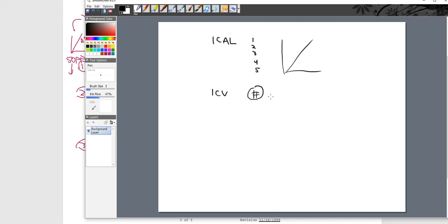That value better match. Cha-ching! Works out great. We're within the threshold of 10%. Okay, I'm feeling good. I did my job. My standards are working. I haven't actually run any samples yet, but it's there.